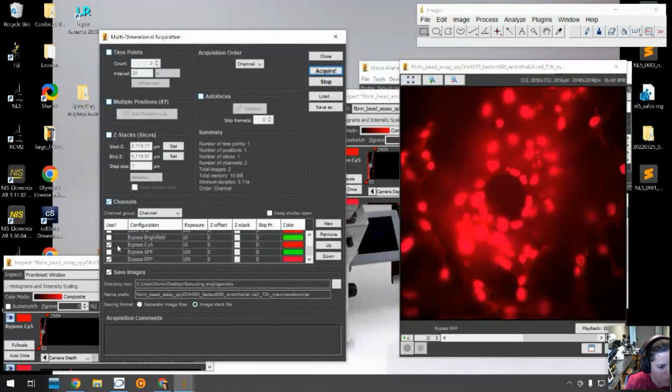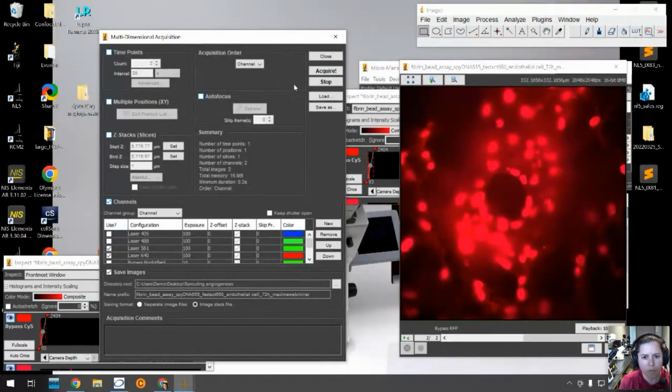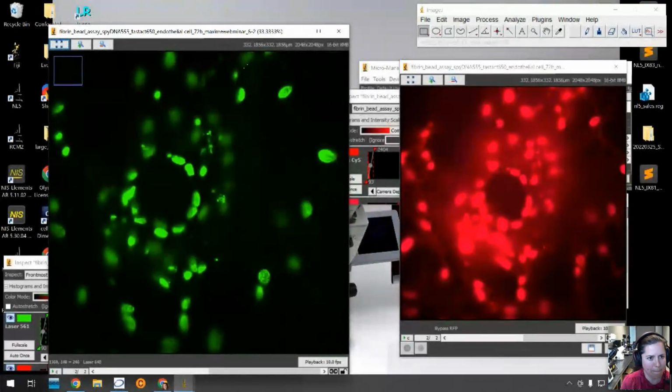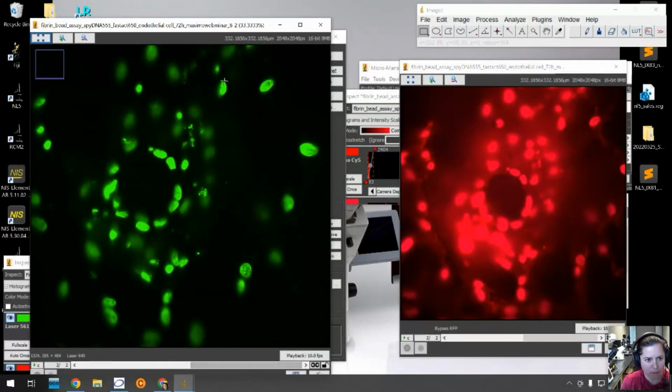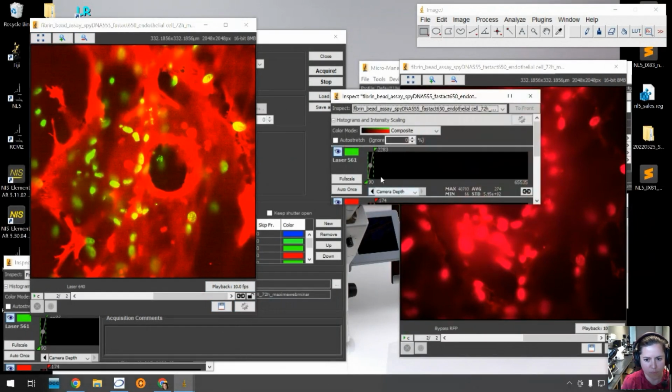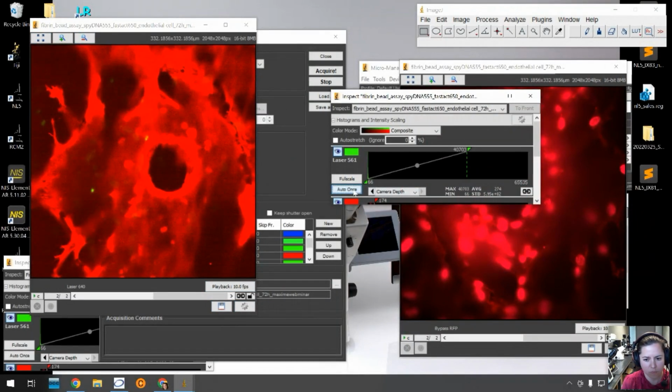And I will immediately acquire with the confocal unit. Let me see.